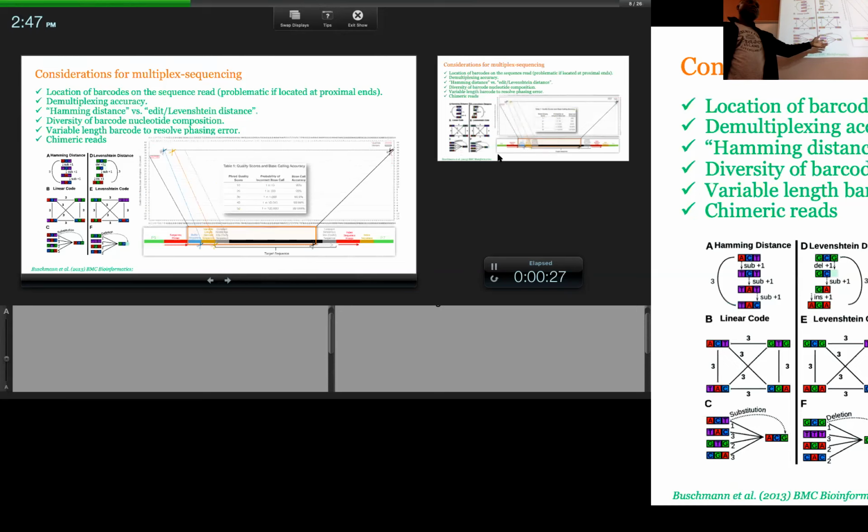All right. And indels can happen how? Maybe during your oligo synthesis, because you're synthesizing your adapters. Those could have errors, or during the actual sequencing on the Illumina platform, you could have errors there. So it's useful to account for both types of errors when you're demultiplexing, so you're not mixing up your samples.